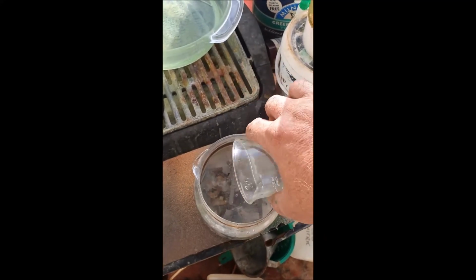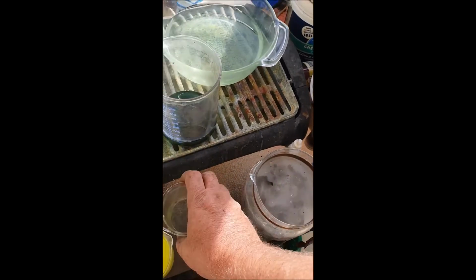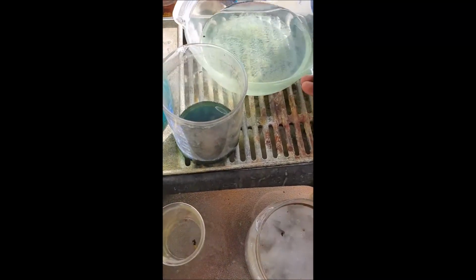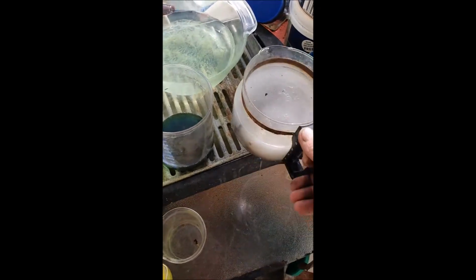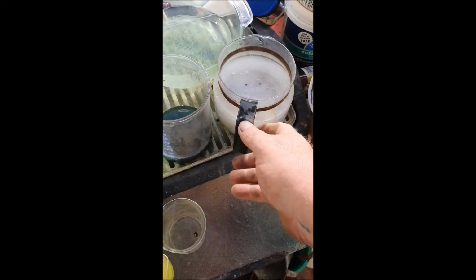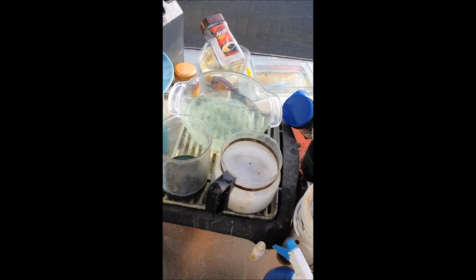You've got to be careful. If you're wondering why I don't have gloves on, I donated my respirator and my gloves to the hospital because of the pandemic, and I've just got to be super careful. If I knew that I was going to have any chance of having it on my hands, I'd wear some kitchen gloves or something like that, but there's no reason for it to be on my hands.